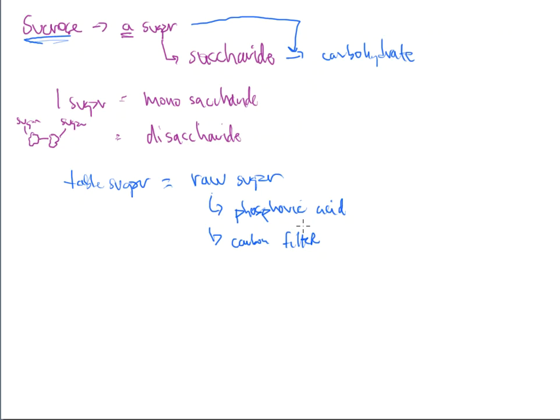So you send some water through a filter. These can even be the aquarium tank filters that are in the back of them, right? And these carbon filters will take out all of the impurities that might be present. Well, the same thing is going to happen here. They're going to take the raw sugar and dissolve it up. All of the impurities go into solution along with the sugar that you want in the first place.